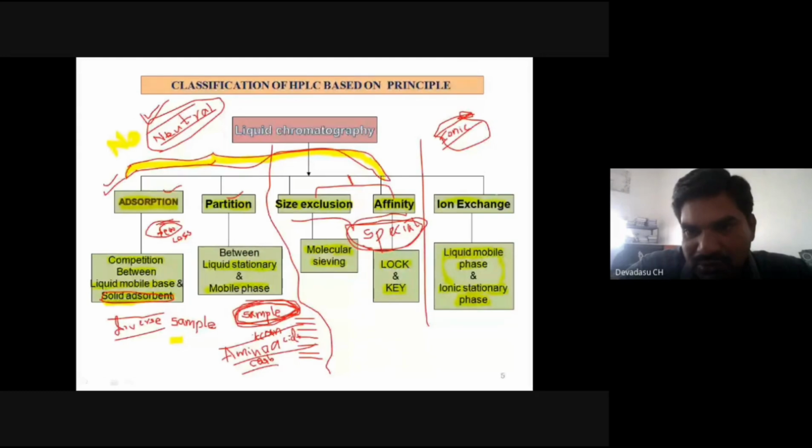regarding that sample. Whereas when I was mentioning special sample, you might have a doubt how the special samples exist in analysis. It's nothing else. In contrast to synthetic molecules, we have biomolecules, which are considered to be the special case of the sample.